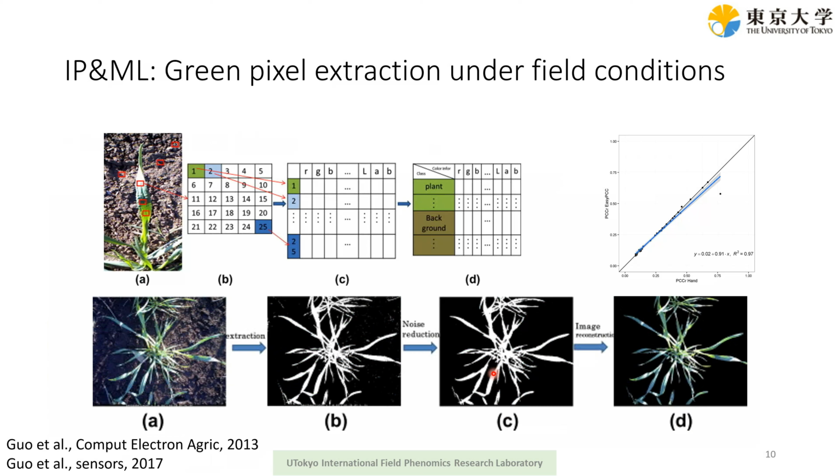So what we did, actually, thanks to machine learning, we found that if you carefully choose the training data from the images, even if we only use the color features in this case study, we can still train a very good machine learning model, and we are happy to have a very good result for the segmentation. We also provided a tool for the public to handle their own problems.